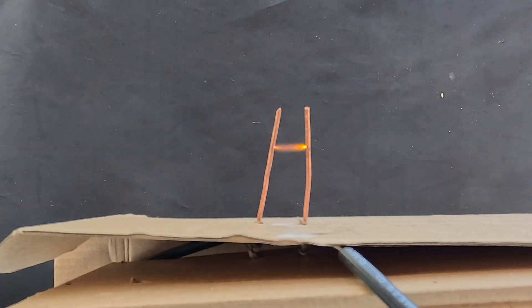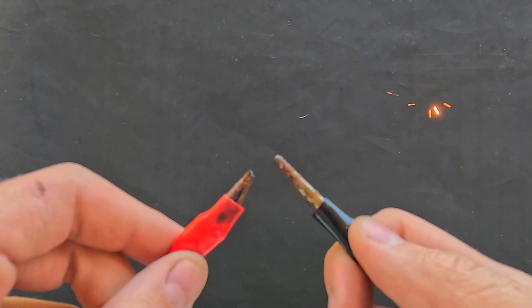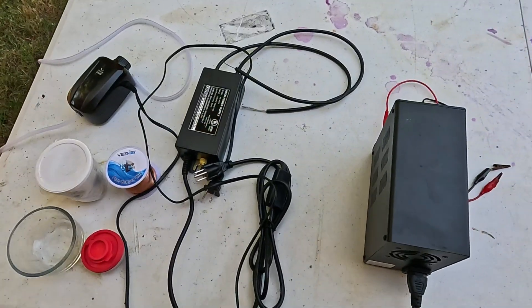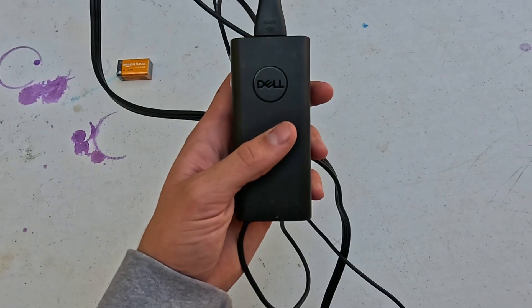I'm going to show you how to simply turn air into nitric acid using electricity. The process is simple — we're going to need to generate a high-voltage electrical arc. So our first step is going to be finding something that can produce enough voltage.